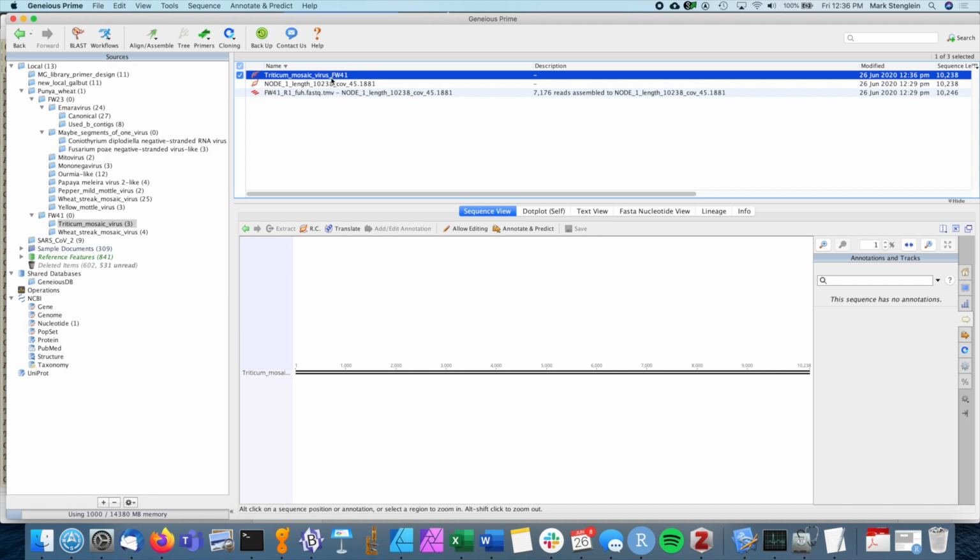It really doesn't get a whole lot easier than this in terms of assembling and validating a virus genome sequence. It just assembled in one piece by SPAdes. It was just in one contig. I couldn't find any problems with that contig. It looked correct.